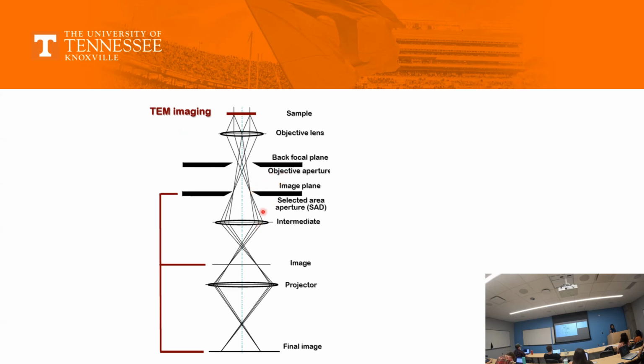And in both cases, in your diffraction, if you choose D, you would have a diffraction pattern versus an image, and both could be magnified using an intermediate lens. And then you have an image that is forming big. So you will see, if you have a lower magnification, you start seeing a D pattern. What I mean is like here on screen.